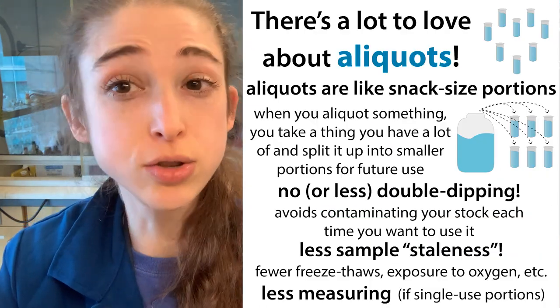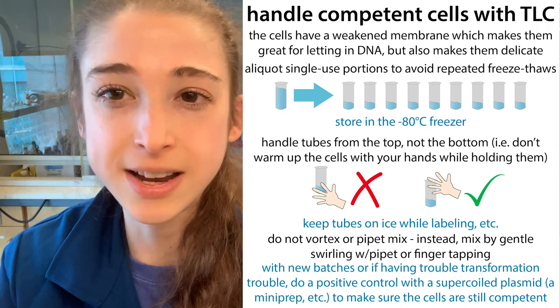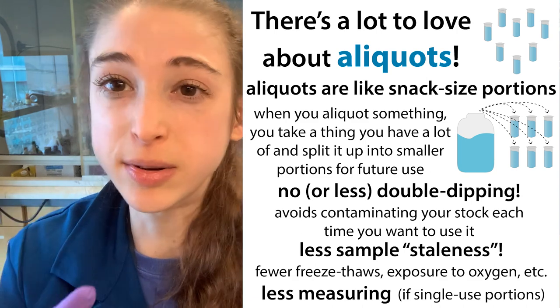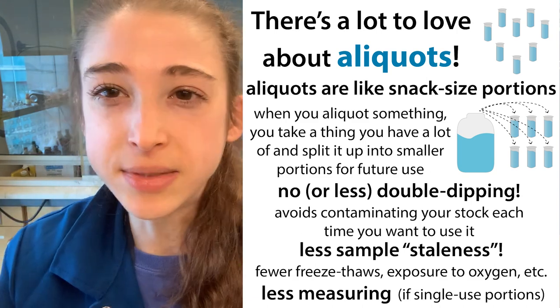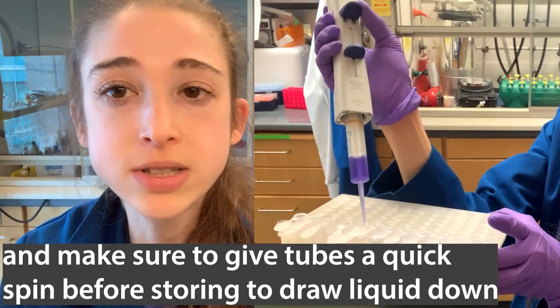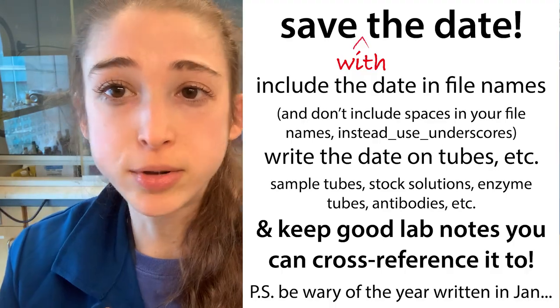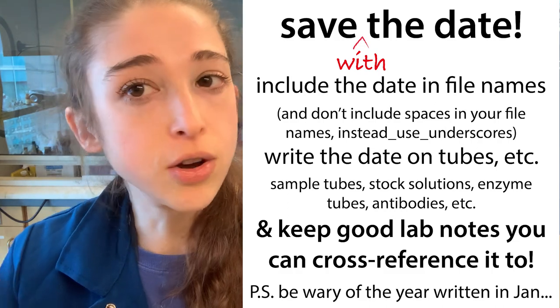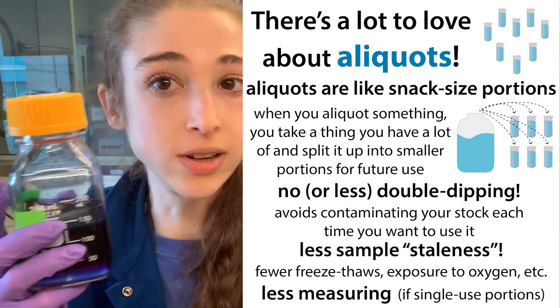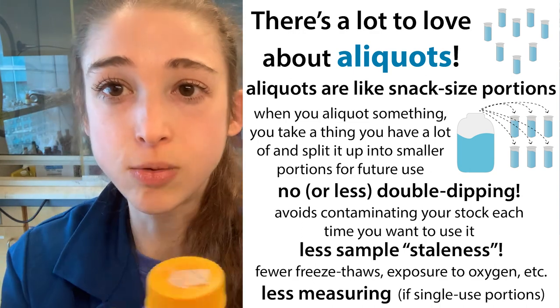For single-use portions, those are really great for things like competent cells, which are really sensitive — you just want to have the amount of cells you're going to add each time. For a protein prep, you might not know exactly how much you'll use, but just have enough for typical experiments. Repeater pipettes are really great for helping make all those aliquots. You can also make aliquots in PCR strips using a multi-channel if you have a lot of something. Remember to label them, put the date so you can go back to the stock, and then go back to the stock when you need to make more aliquots — you don't have to aliquot it all out at once.